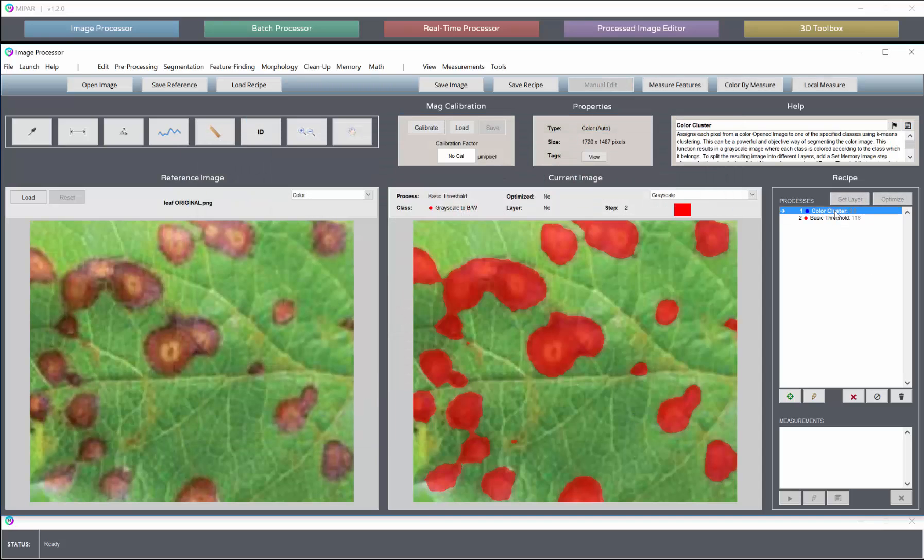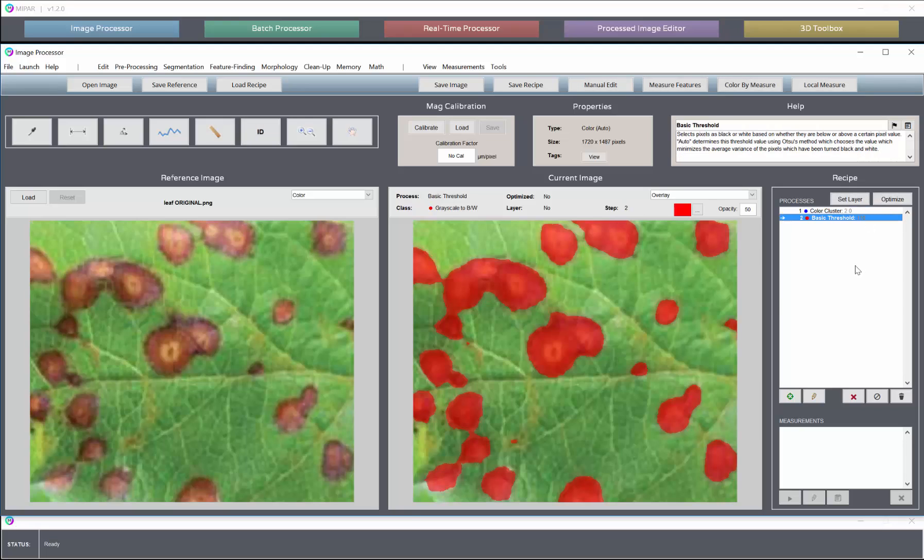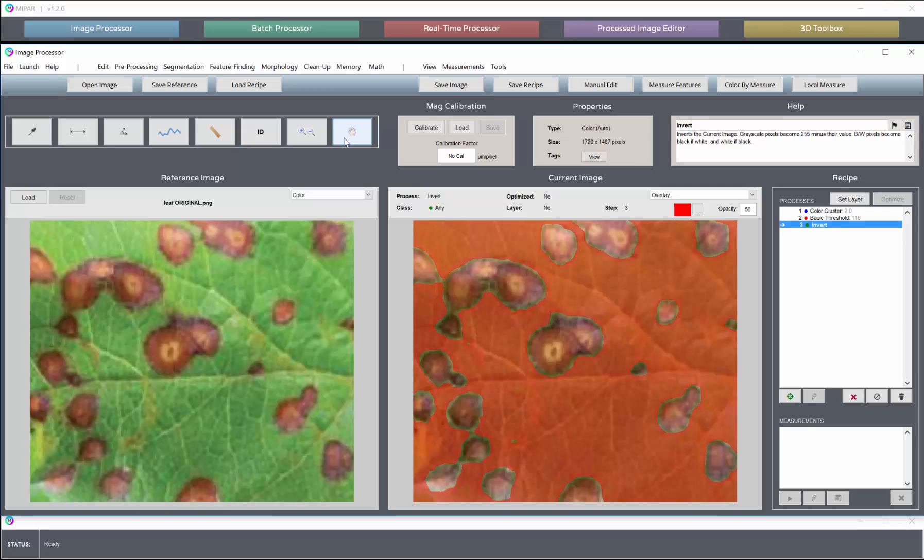So the output of a color cluster step is grayscale, and we can then run a threshold on it to keep any or multiple classes that have been selected. We could just invert now to select the background.